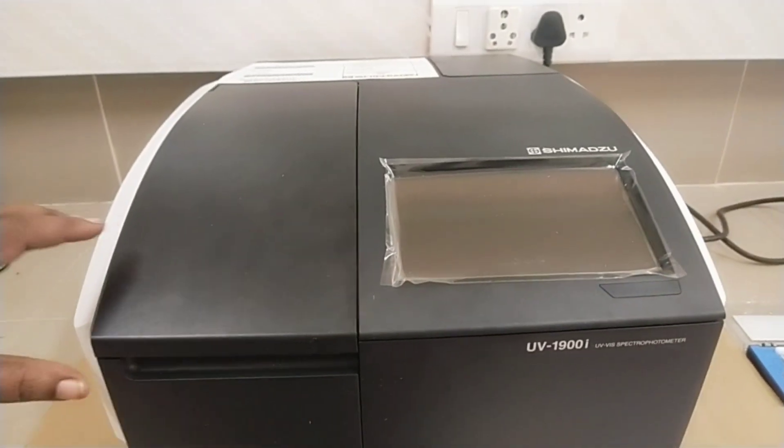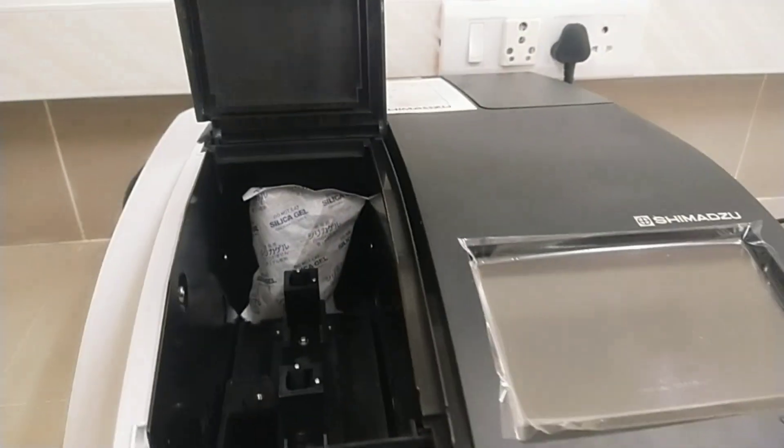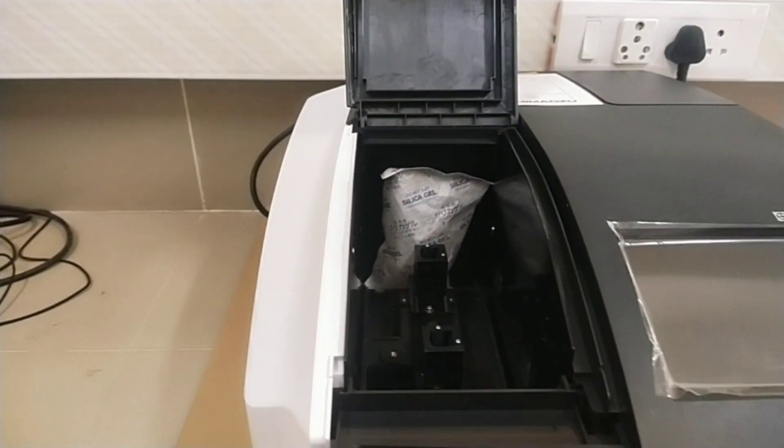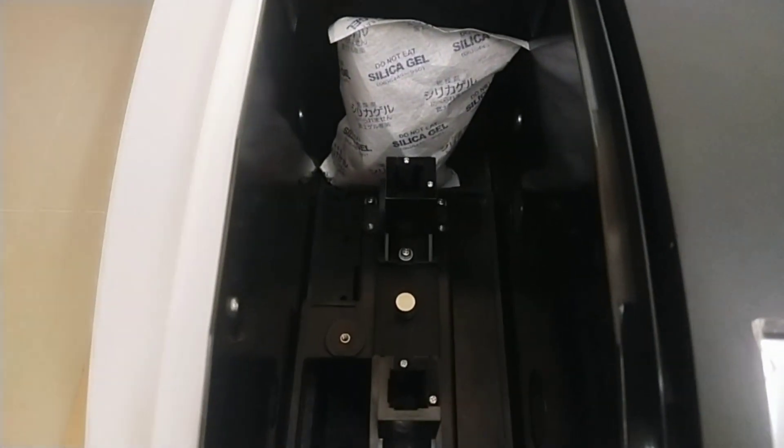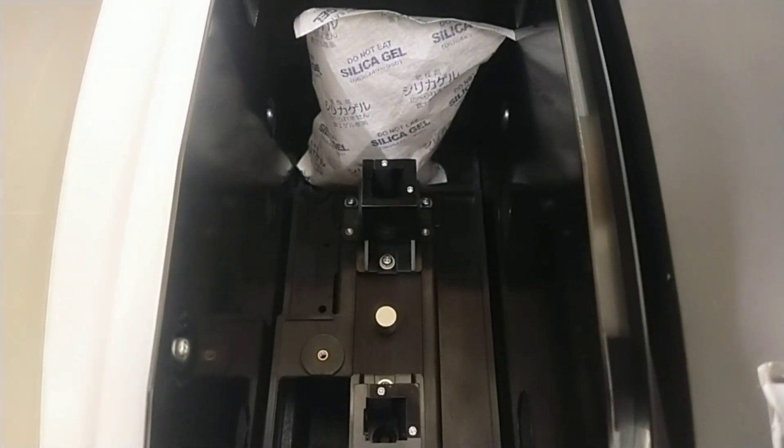This is the sample compartment. Inside the sample compartment you can see the sample cell holder. It is a dual beam spectrophotometer, so both sample and blank can be placed at a time. Distance between the two light beams is 100 mm.